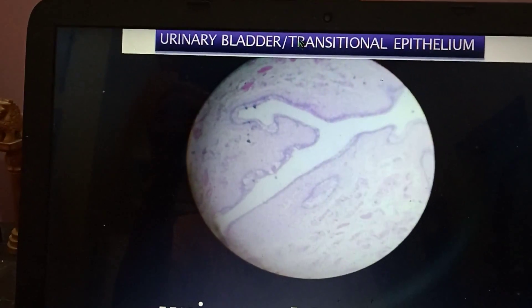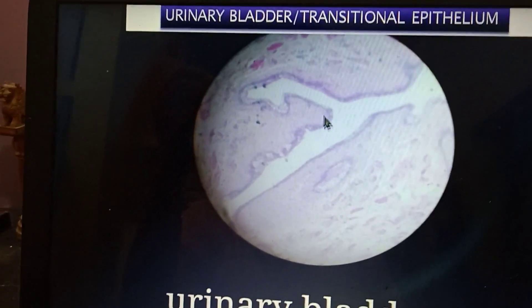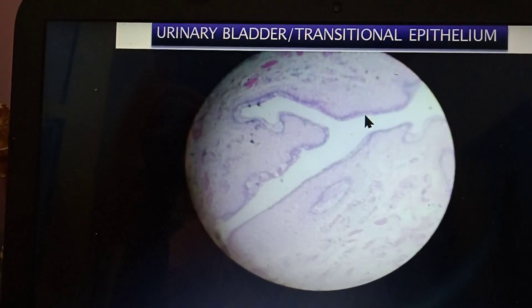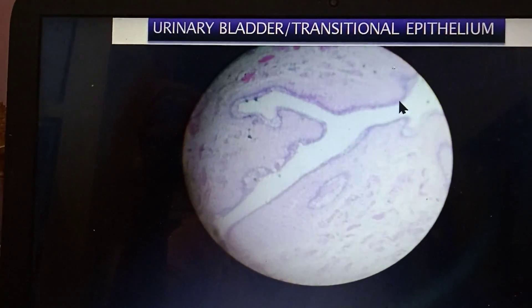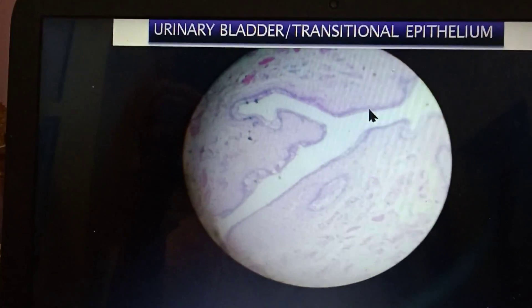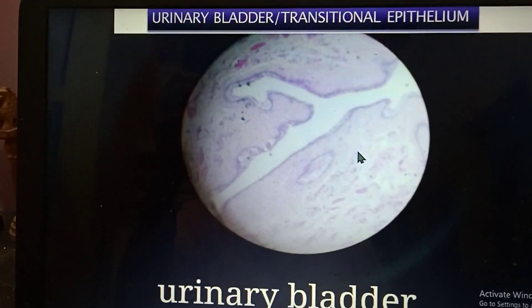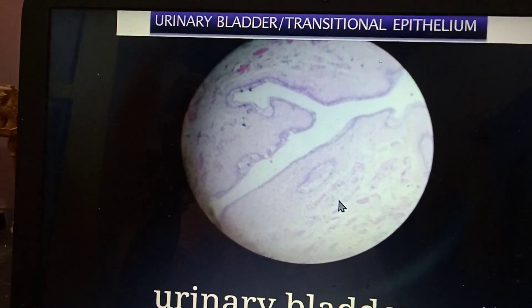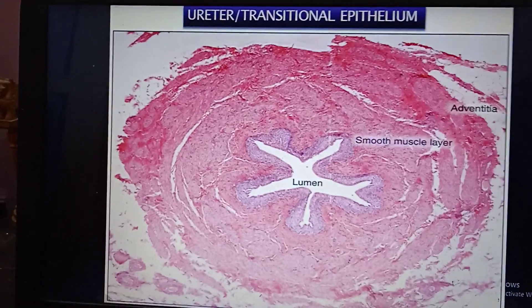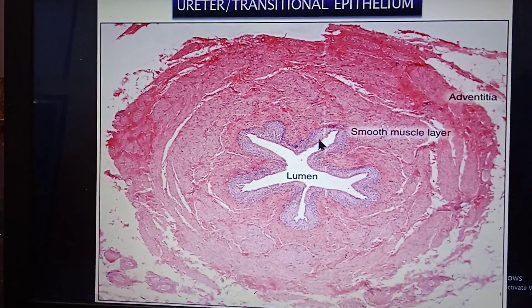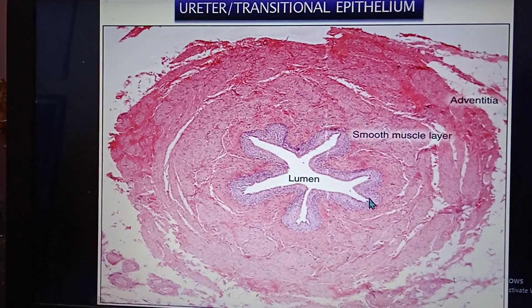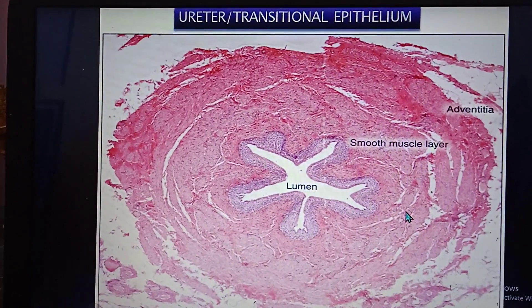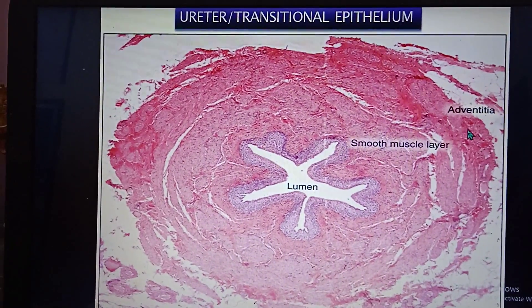This is the urinary bladder and we write transitional epithelium because it transitions between two to four or up to six layers — that is very much characteristic of the urinary bladder. The histological layers are mucosa, then muscle layer, and then adventitia. This is the ureter, again transitional epithelium, where the epithelium transitions from two to six layers; histological layers are mucosa, muscle layer, and adventitia.